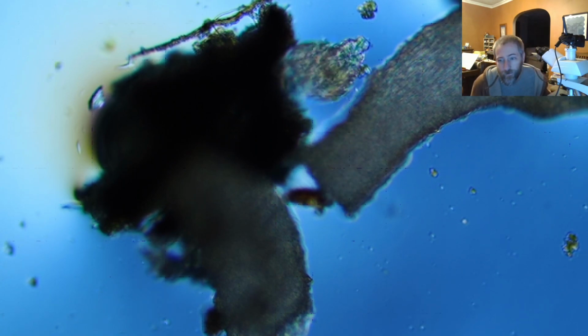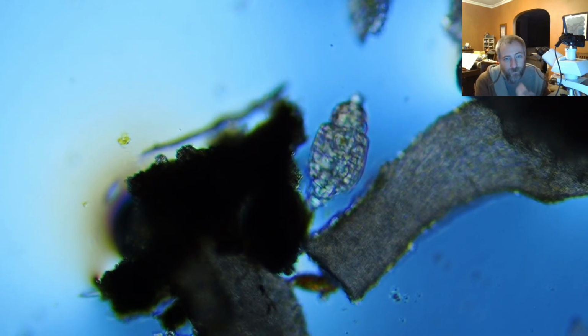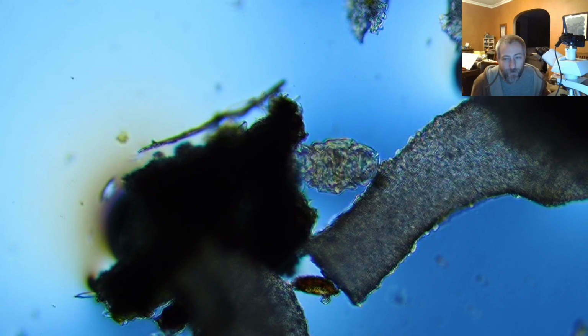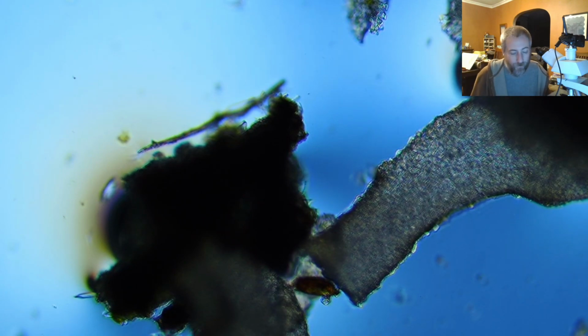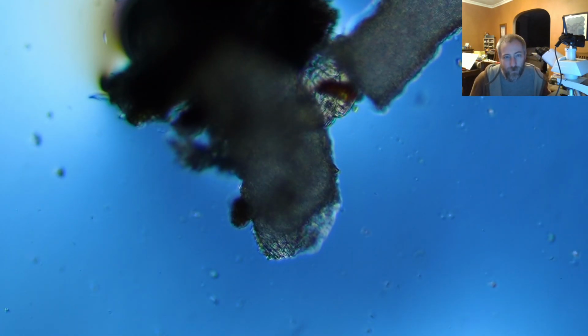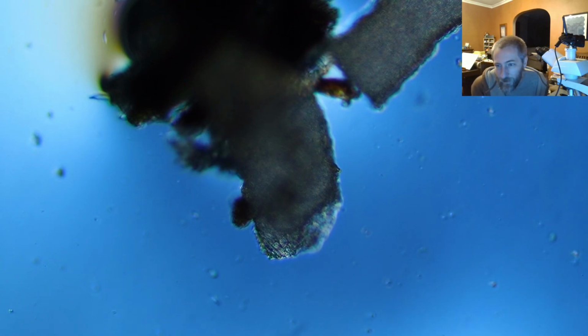Of course, the SEM won't work very well at Mama Bonbon because things are usually dead in the SEM. I could also zoom in. I have higher powered objectives. This is actually the lowest powered objective on this microscope, but the higher the power you get, the smaller the working distance gets, and also the less depth of field you have. Those are just normal photographic concepts. When you get closer to something, the depth of field shrinks, so I could get it bigger, but more of it would be out of focus, and it would be harder to showcase. So what I've been doing is leaving it at 100x and zooming in digitally. It's got the depth of field, but it's just bigger, and I think that works pretty well.